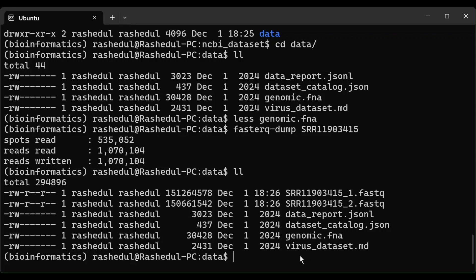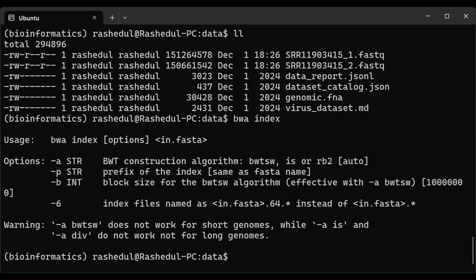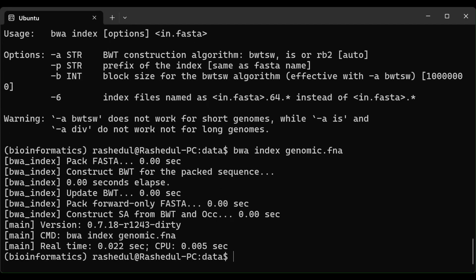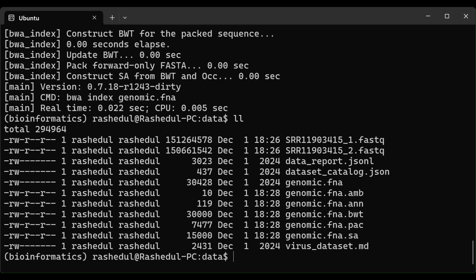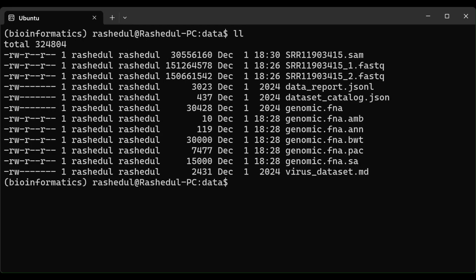The first step is to create the index using BWA. We will create the index of the reference genome file using the bwa index command — it shows the usage for bwa index. After bwa index, we need to provide the genome file. It has created the index; after creation, several files are created with extensions .amb, .ann, .bwt, .pac, and .sa. This is how BWA creates the index for the reference.